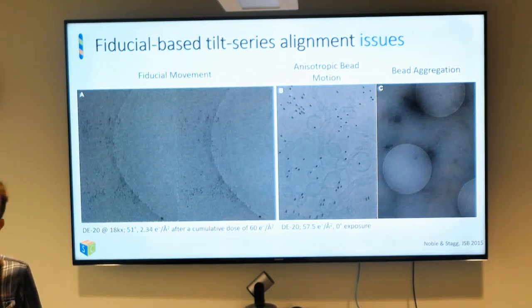Unless you want to do CLEM, that's actually a use case where they try to do some light microscopy and hopefully it's also EM sensitive or electron dense, to a varying degree. There are not many examples. It's not very easy. You need something that's electron dense and biologically inert, hopefully, and there's not much.